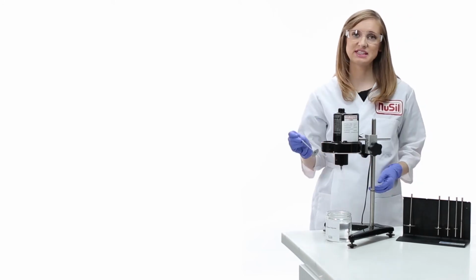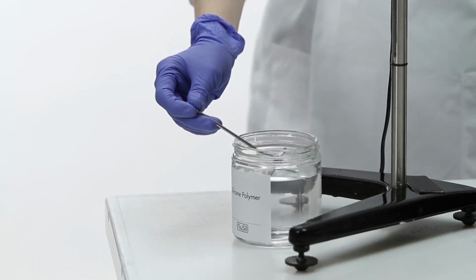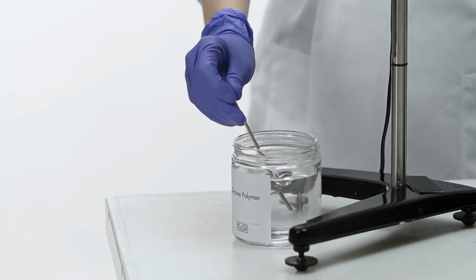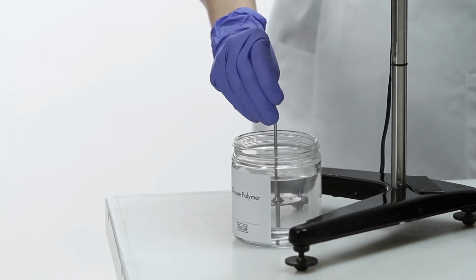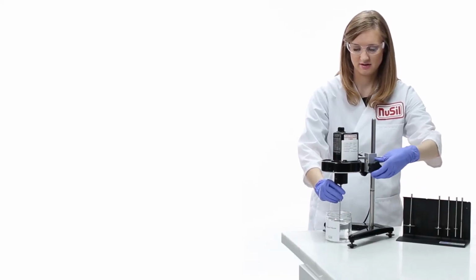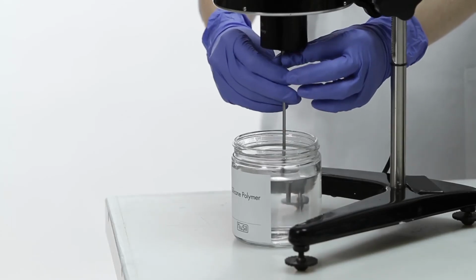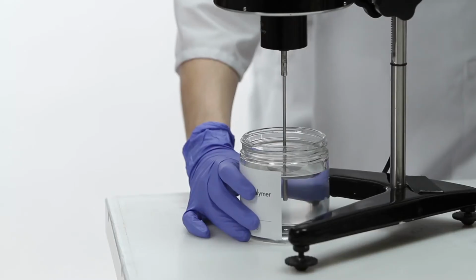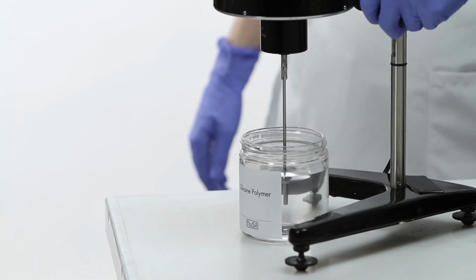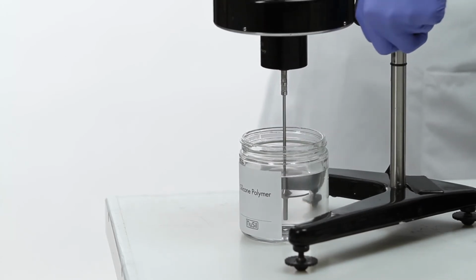When you introduce the spindle into the material, be sure to put the disc in at an angle slowly until the disc is fully submerged. Then lower the head down and screw in the spindle. Then center the spindle in the jar and again lower the head down until the surface of the material lines up with the notch on the spindle.